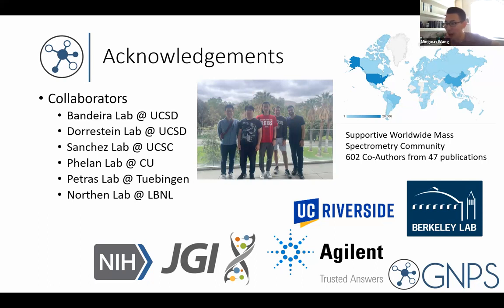From Xinghui: are you considering the function where, once you apply a MassQL query, you can download the molecular network of the feature list of compounds that have that specific fragment? So yeah, the answer is yes. One of the new things is that we're all about integration, right? And being able to export, and you can do whatever you want in other tools.